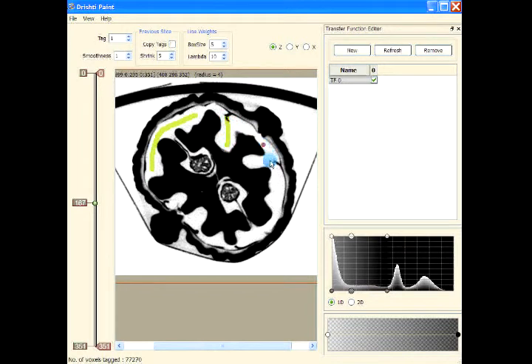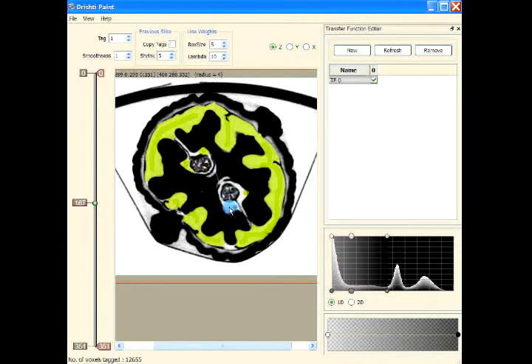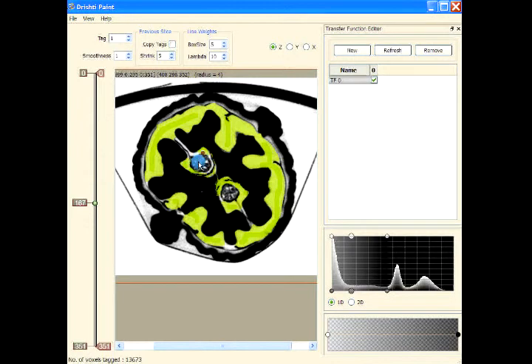If you want to tag just the interior region, mark that region as the object region and then press T to tag it. Similarly, you can do this for other interior regions. If you don't want to tag a particular area, remove the tag from there using the right mouse button.